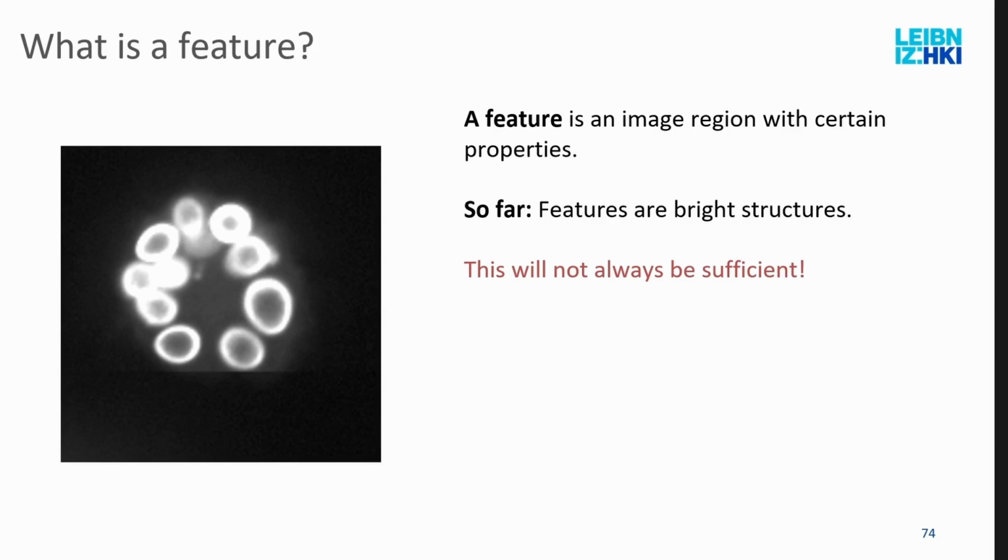Bright pixels are the ones that we care about, and thresholding will react to that, because this is what it does. But this is often not enough. You sometimes want specific other things from the image that may or may not be bright, or have some other properties that differentiate them from other elements.